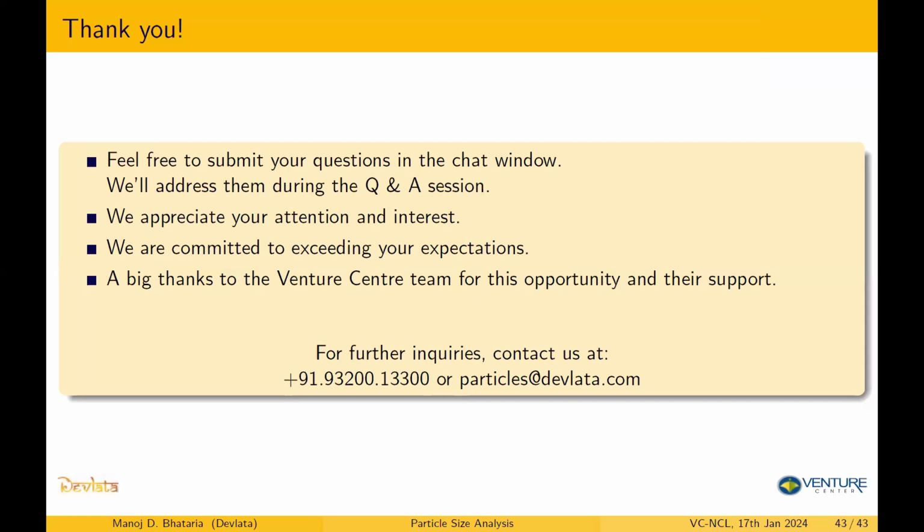Yeah. Am I audible? Yes, you're audible. I just wanted to ask that sir has shared in the disadvantages of DLS that it is not possible to have a broad range of particle size distribution. So he hasn't mentioned any kind of range. So will we be able to get any kind of range for that?